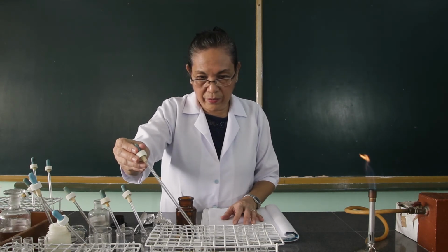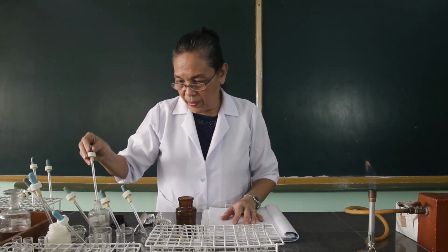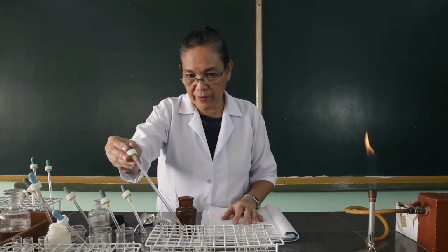Four drops. 1, 2, 3, 4. 4 drops. 1, 2, 3, 4.